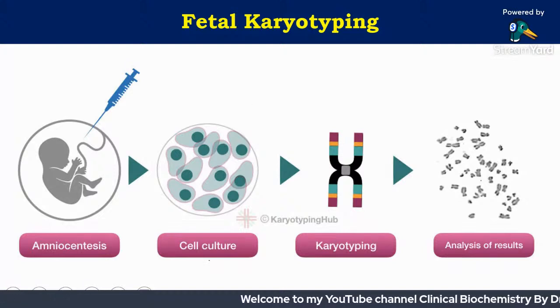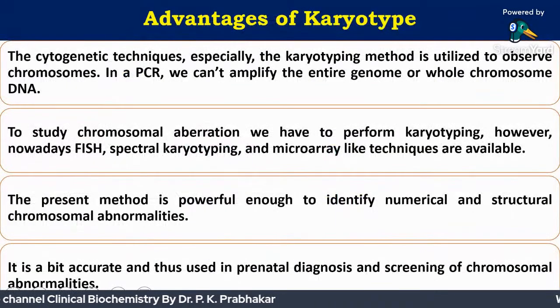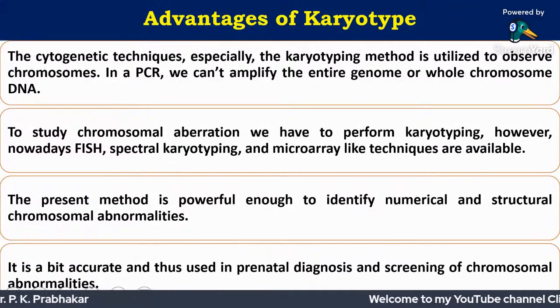Cells will be cultured, karyotyping will be done, and the result will be analyzed. So this is the whole process of karyotyping. Now, what are the advantages of karyotype? What are the disadvantages of karyotype?